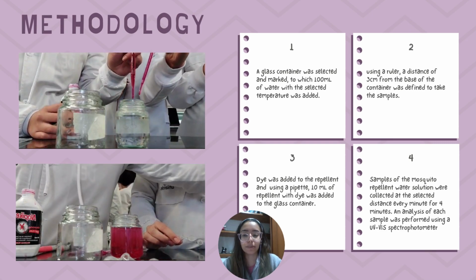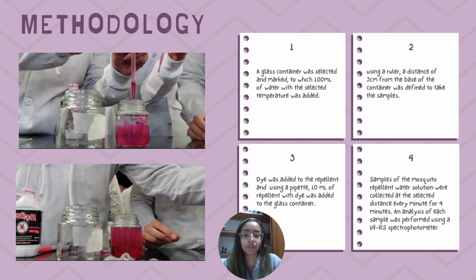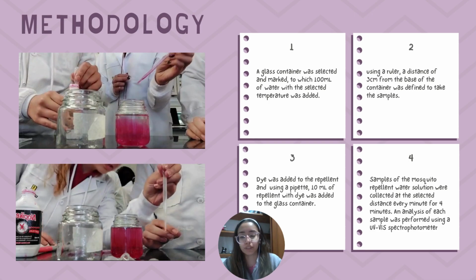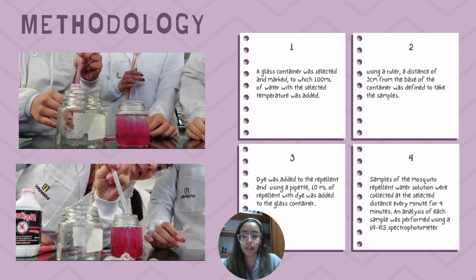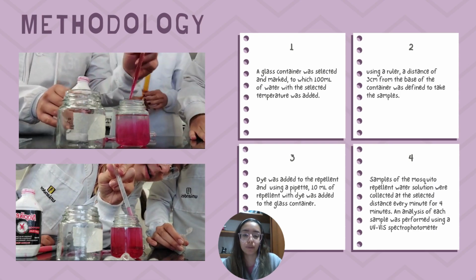After defining the water temperature at 10 degrees Celsius, a glass container was selected and marked, to which 100 milliliters of water at the selected temperature was added.